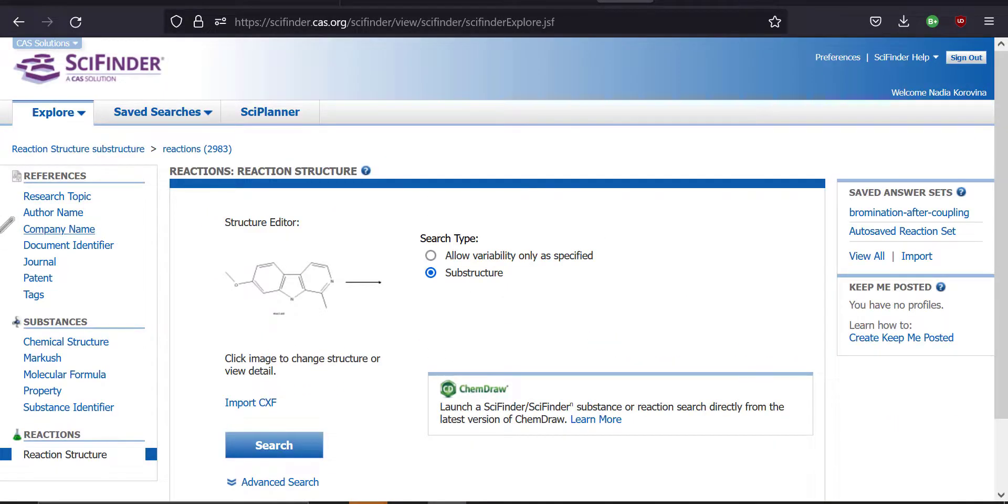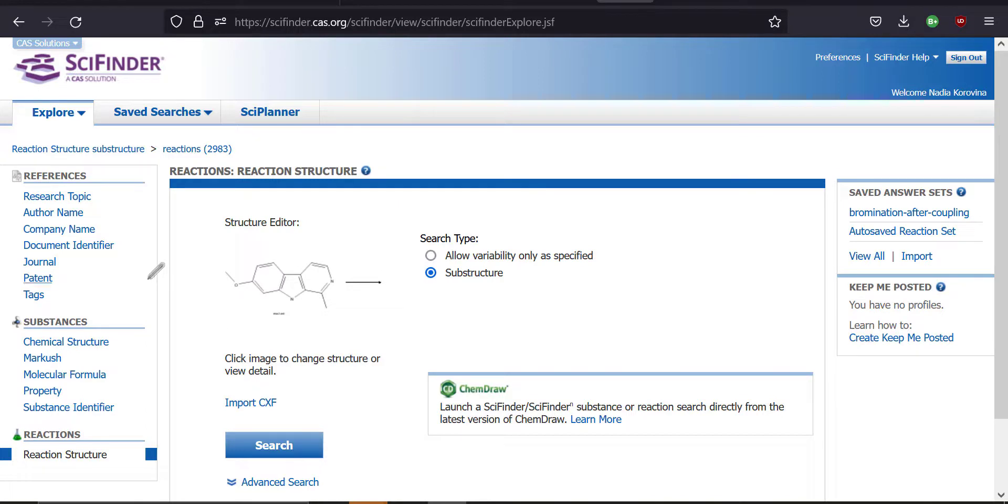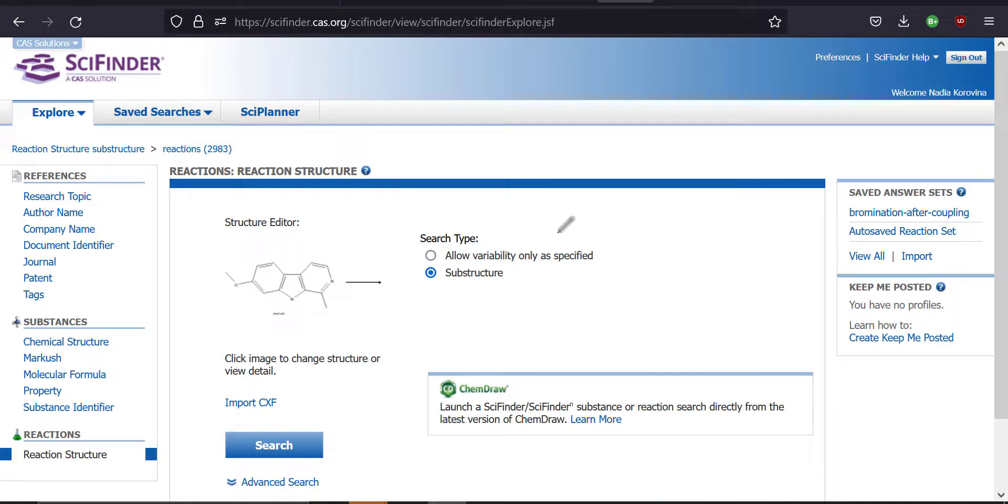All right, well there's a lot more to SciFinder than this. This is a very powerful tool for organic synthetic chemistry, but this will at least help you get started for searching how to synthesize various molecules that you're interested in. All right, so I'm just going to end the SciFinder tutorial here. Hopefully, you'll be able to find a lot of useful information using this tool.